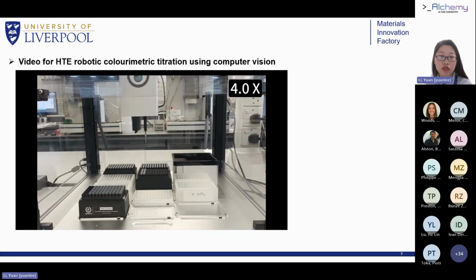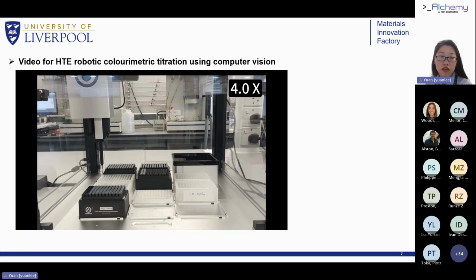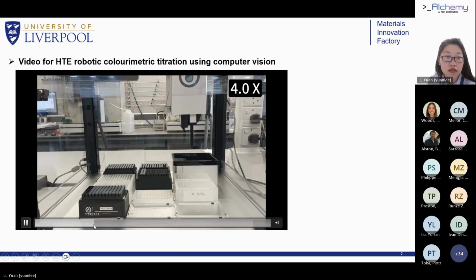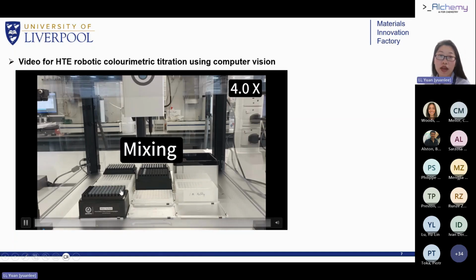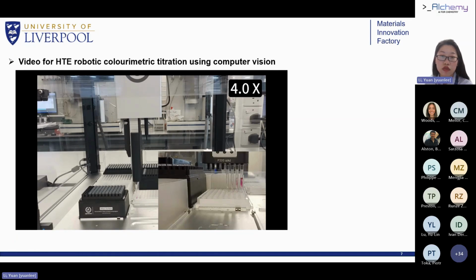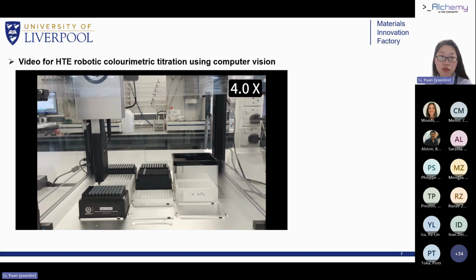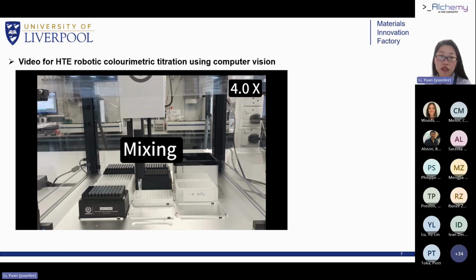Then the pre-estimation stage was triggered. 4 different concentrations of the potassium permanganate will be added. And one extra mixing was introduced to make sure the reagent reacted thoroughly. And the reagent tips will avoid cross contamination among different samples.